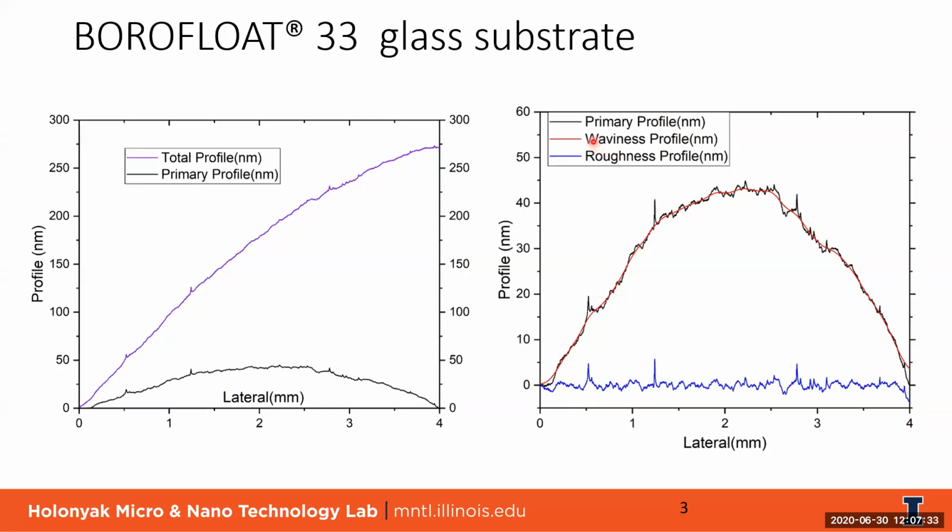That is what we call a waviness profile in the software, that will allow you to measure the wafer deformation. But whatever is rejected by the long pass filter is shown in the blue curve, and that's what we call the roughness profile. And that's where we generally apply the root mean square equation to extract the surface roughness, the RMS value.